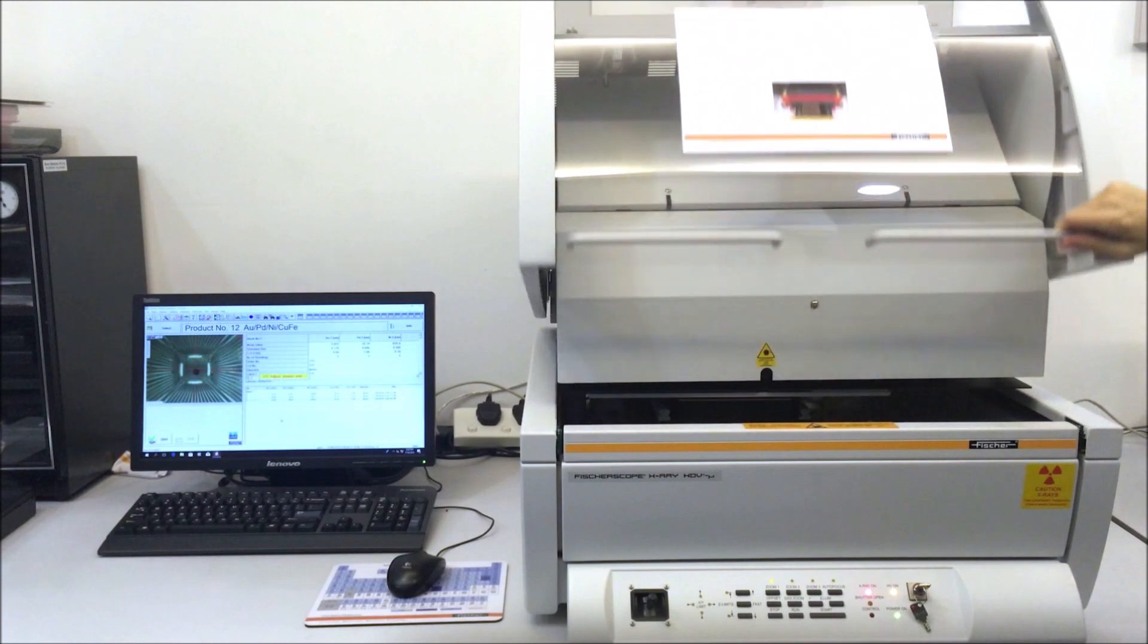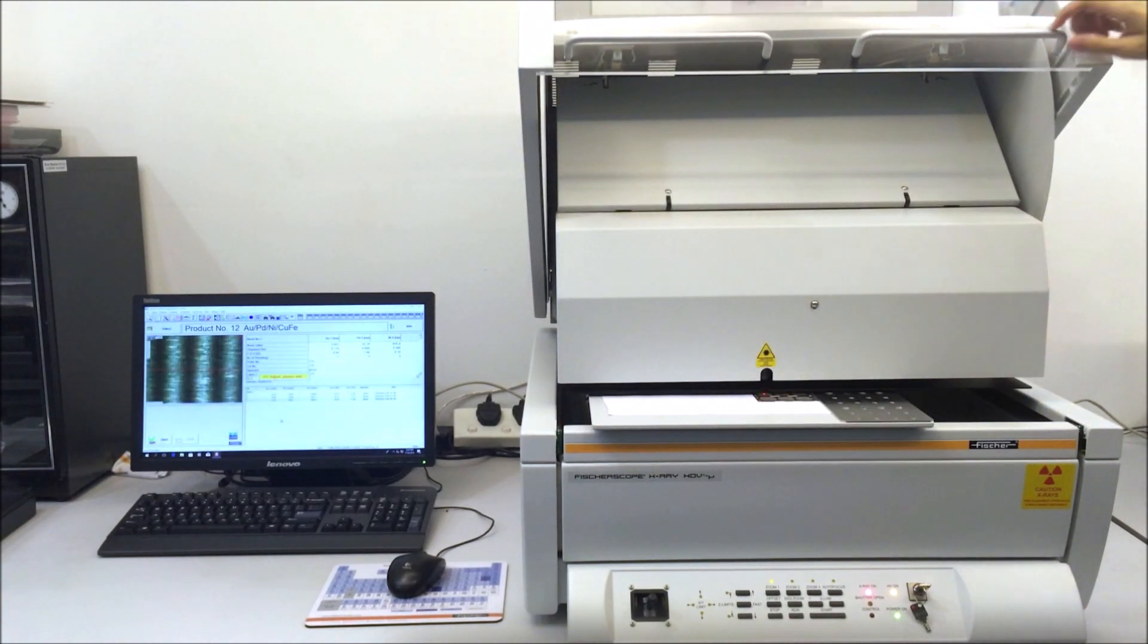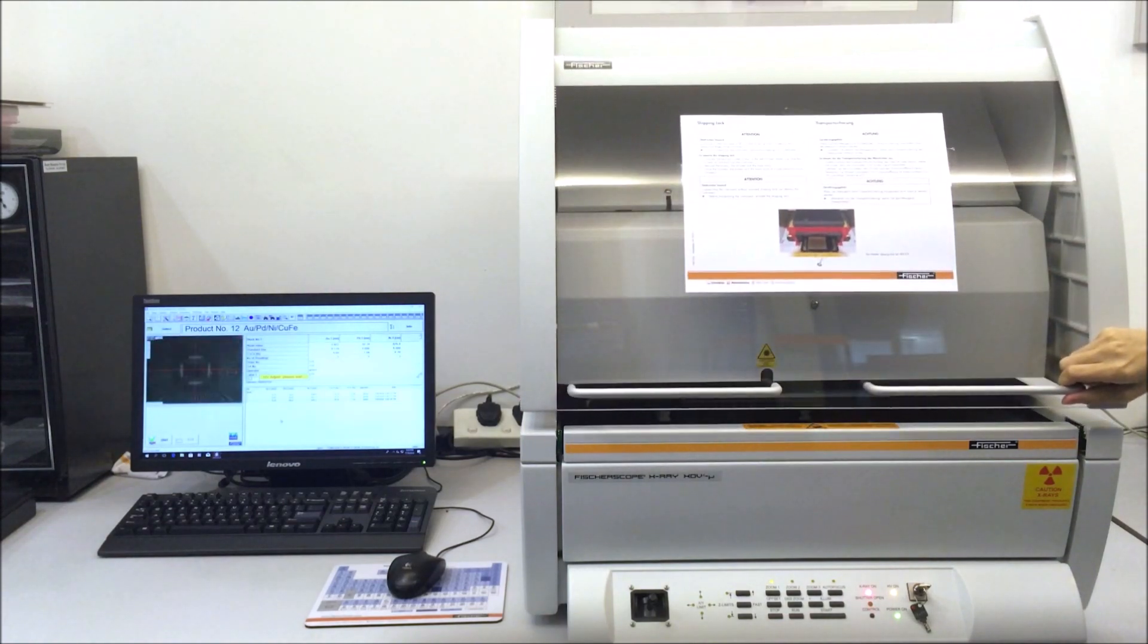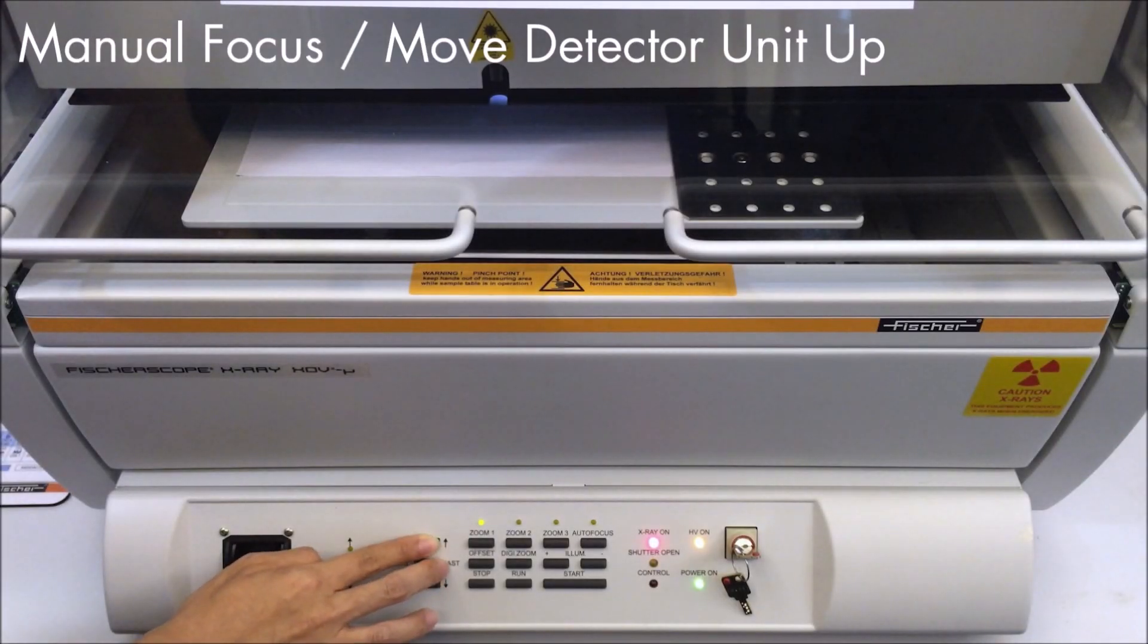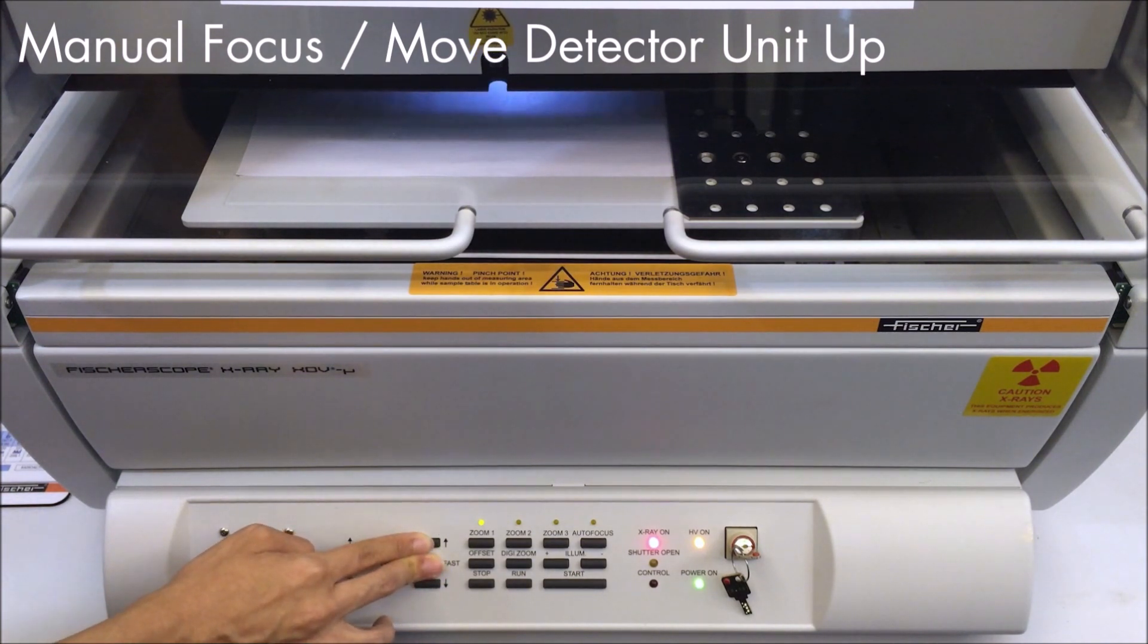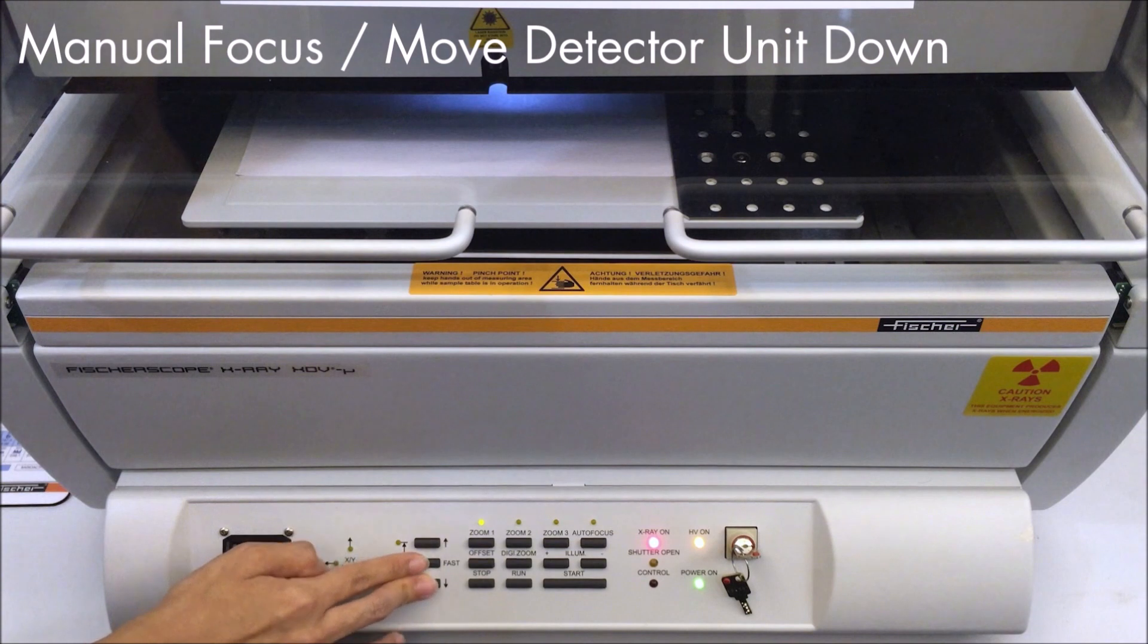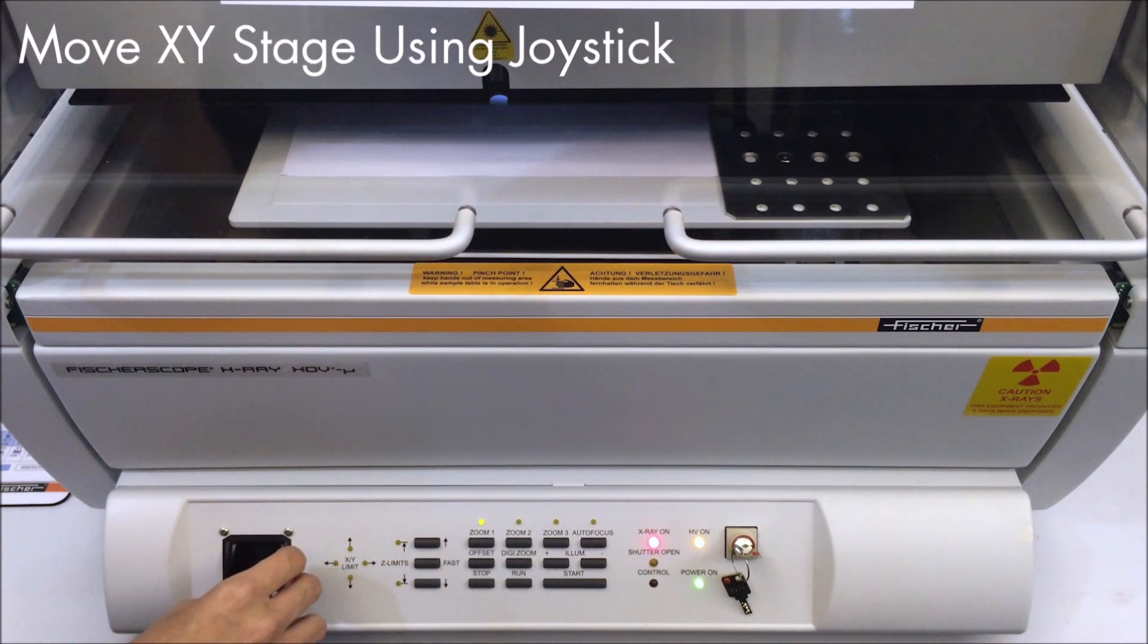The XDV-µ is a benchtop x-ray fluorescence instrument which has a polycapillary tube, silicon drift detector, and a programmable XY stage. This makes it excellent for automated measurements on very thin and small coatings and components, especially in the electronics and semiconductor industries.